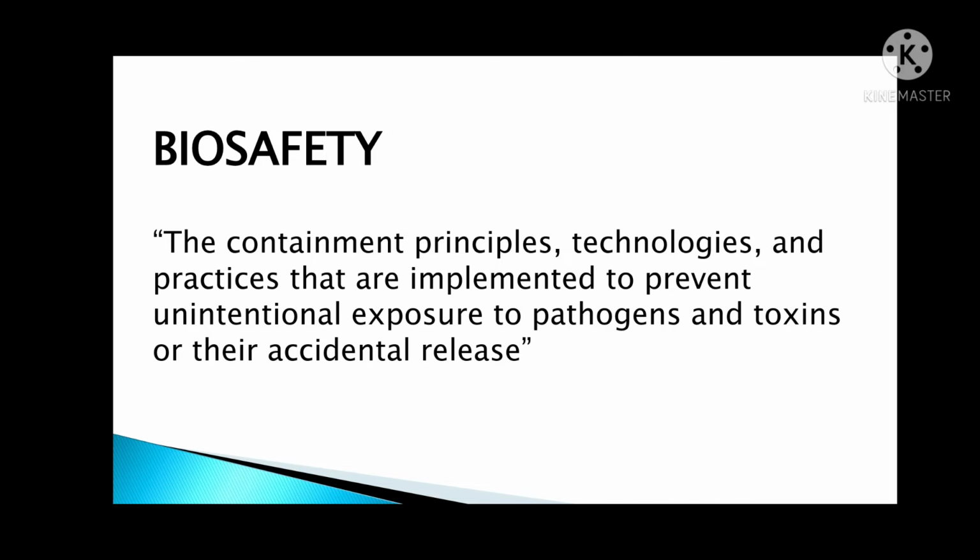In simpler terms, class, biosafety means the application of knowledge, techniques, and equipment to prevent personal, laboratory, and environmental exposure to potentially infectious agents or biohazards. Biosafety is defined as the containment conditions under which these infectious agents can be safely manipulated.